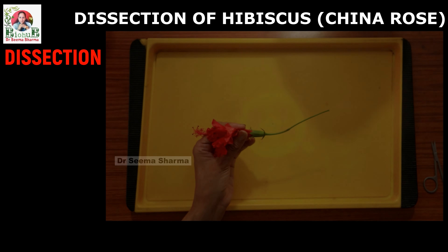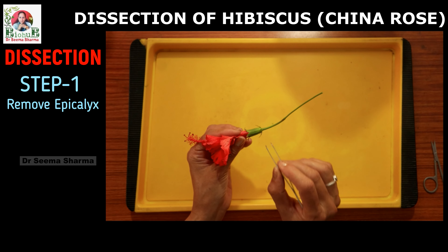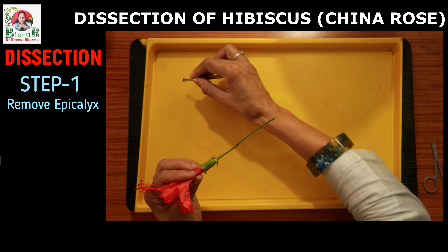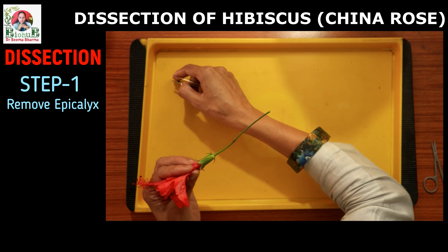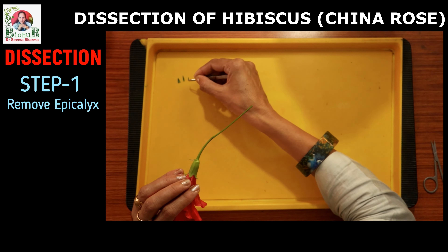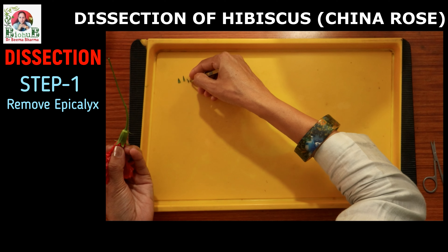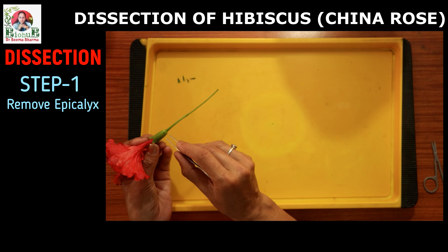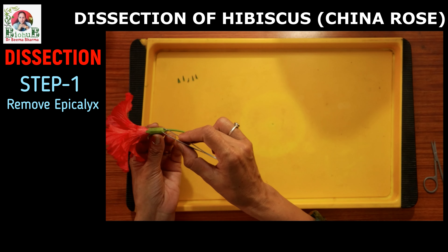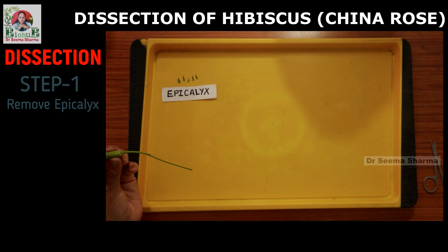Whenever we start dissection of a flower, always remember we start from the outermost floral whorl. So here, just hold the flower gently and start plucking these green tiny leafy structures of the epicalyx one by one with the help of a forcep. Place these on the dissection tray or on a sheet of white paper. You can see the epicalyx of Hibiscus rosa sinensis is made up of 5 tiny green leafy modified bracteoles. Annotate these by placing a label slip.